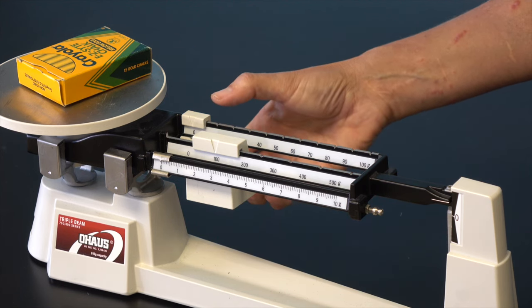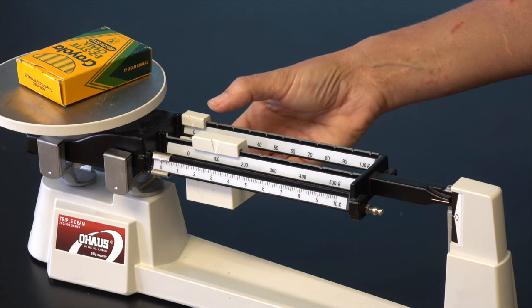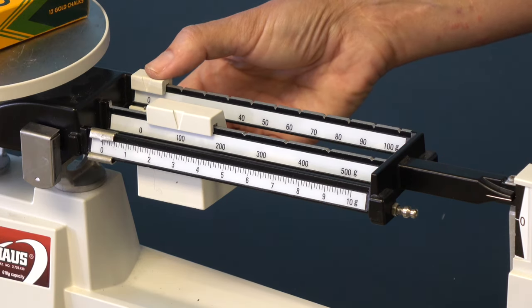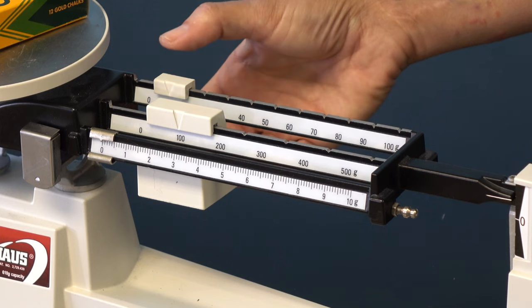Second, the 10-gram rider is moved in exactly the same way. It is advanced until the pointer drops below the zero mark, and then it is backed up one notch.